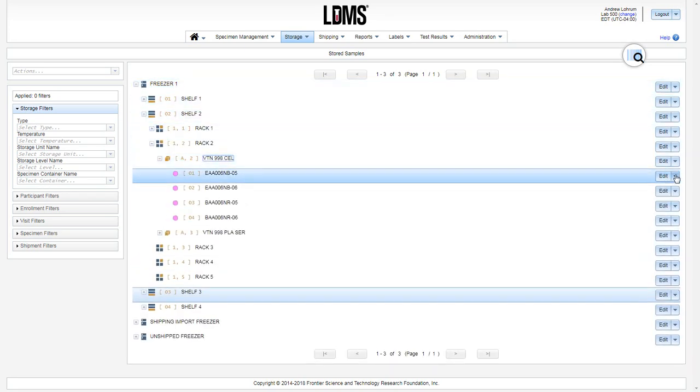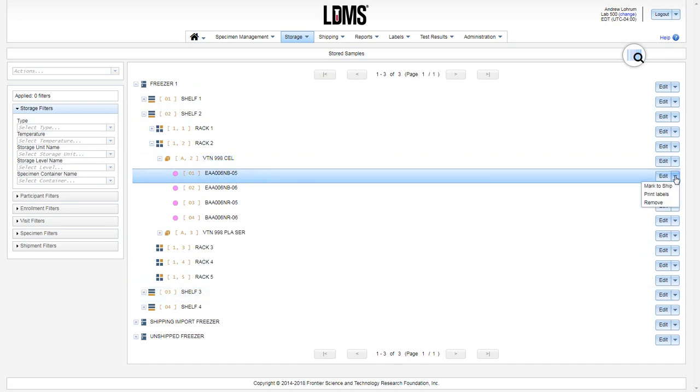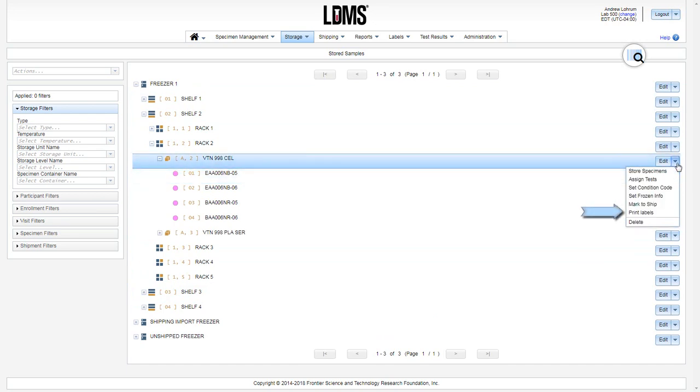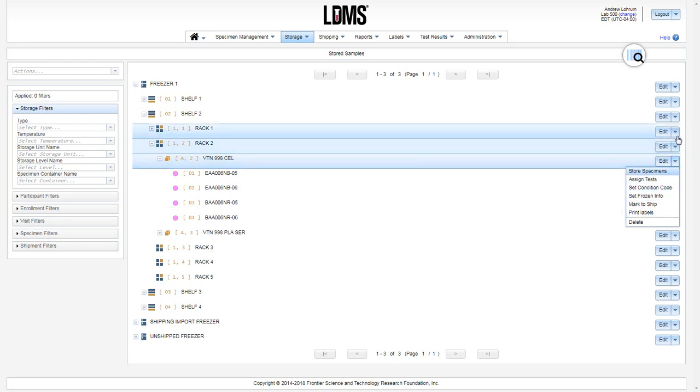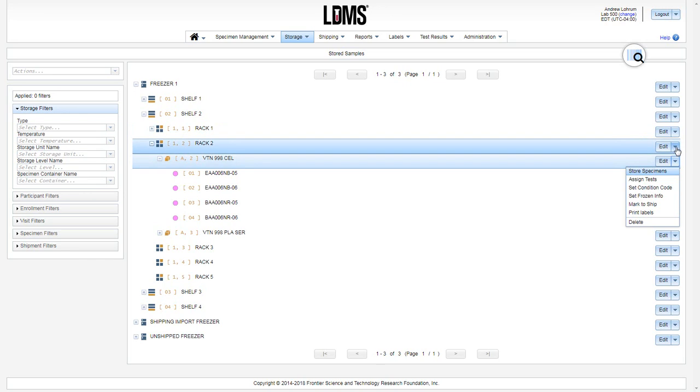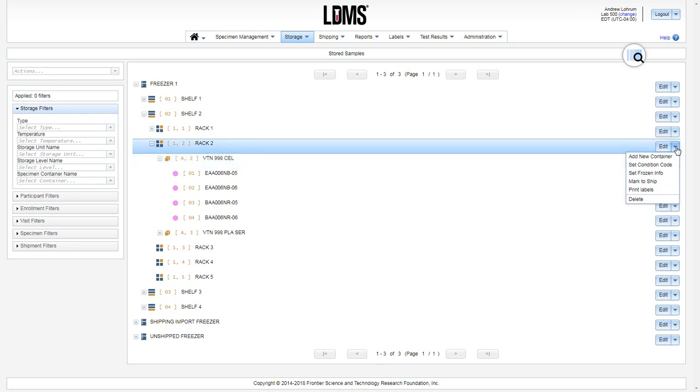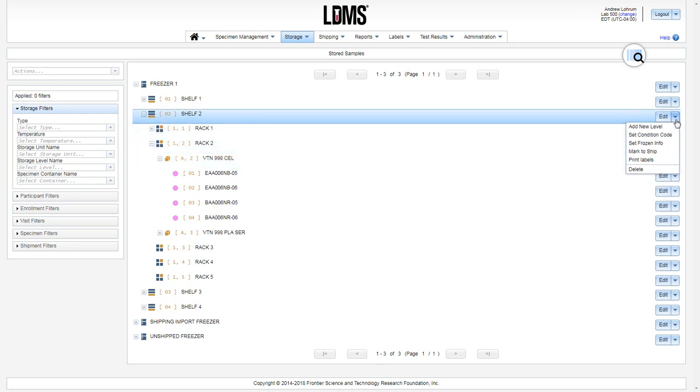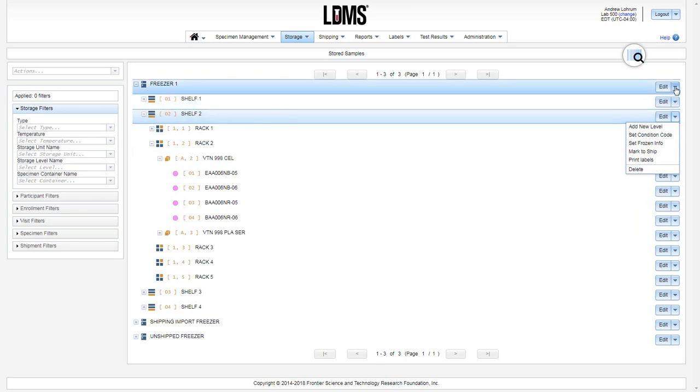You can print an individual label by clicking print labels to the right of the specimen. You can print labels for all of the specimens in the storage item by using the print label option at that level - either a container, a sub-level such as a rack, shelf, and even the freezer.